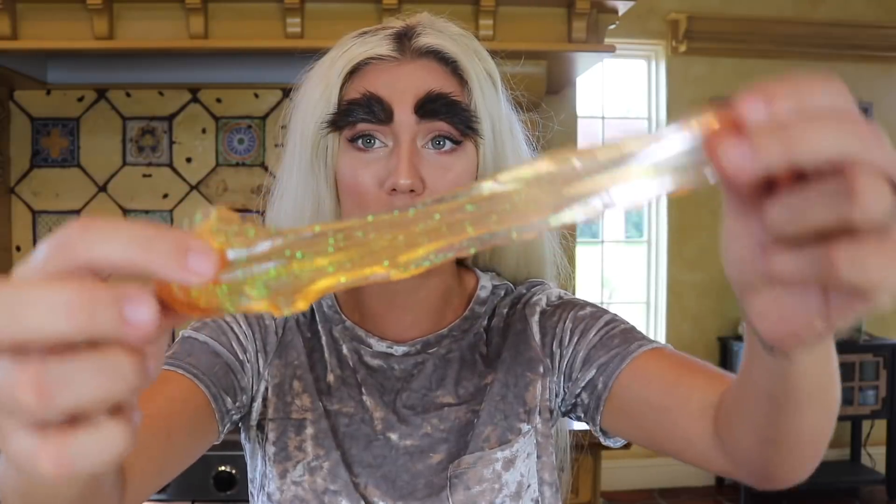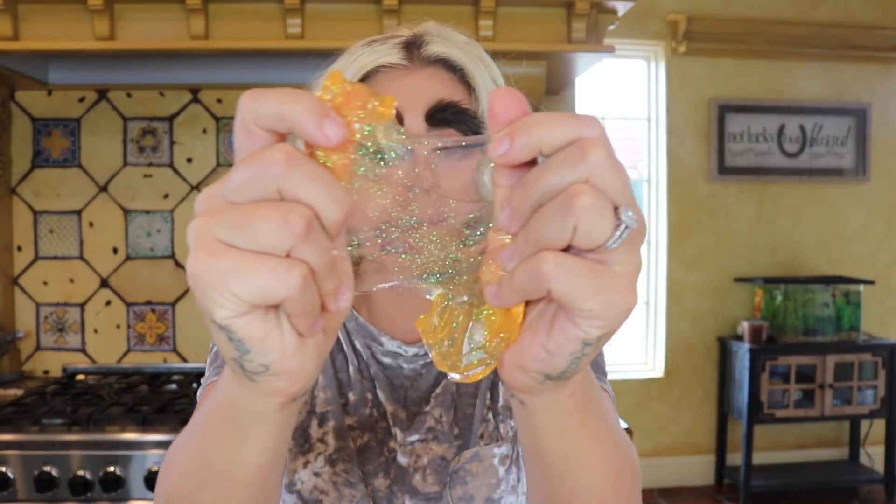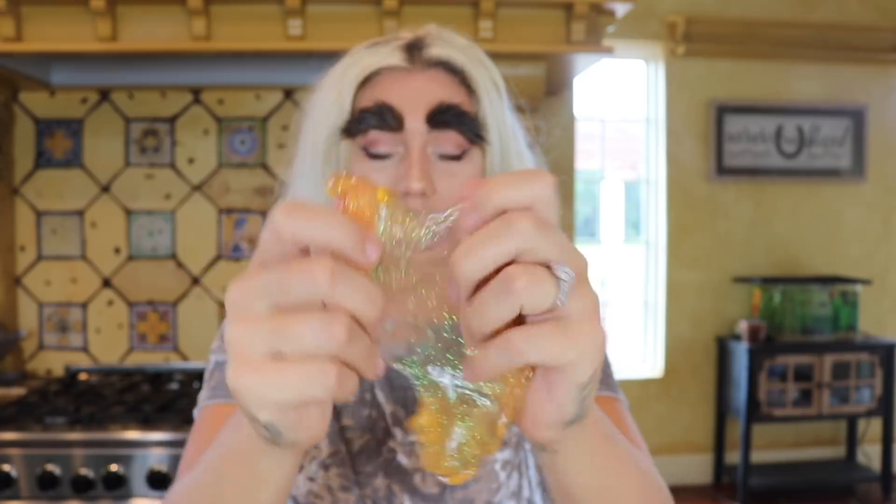Oh my god — there's my thumb. Look at how much dry skin is on my thumb. That's my thumbnail. That is so gross. This microscope is crazy. Those little black things were literally on this slime. I'm going to hold it like that and let's check it out. Do you see that little pink fiber? What is that? Wow, it looks like stars.